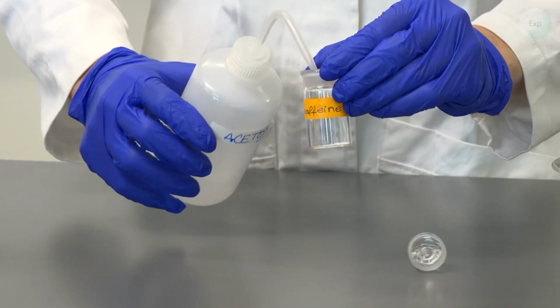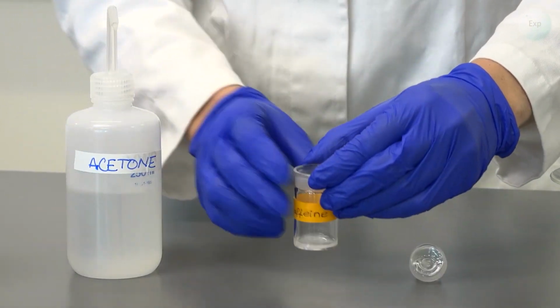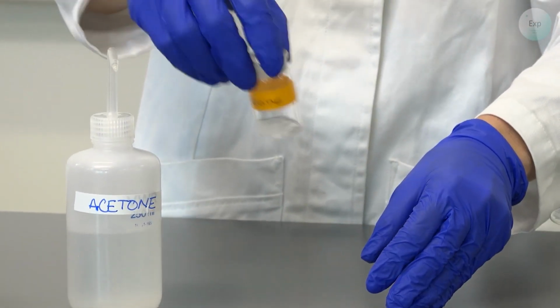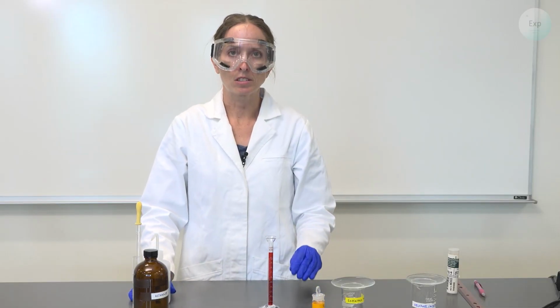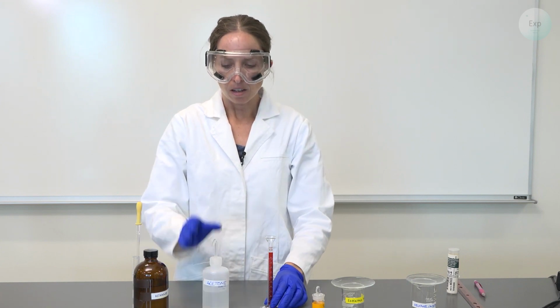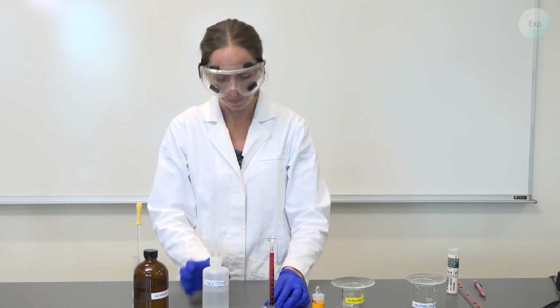I'm going to just squirt from the acetone into this bottle and swirl a bit to dissolve the caffeine. I am going to prepare the TLC solvent now. I'm going to have a ratio of acetone to hexane, a 1:2 ratio. So I'm going to measure 2 milliliters of acetone first.